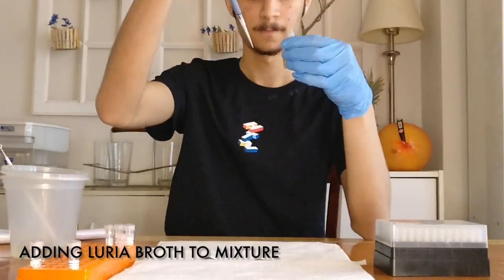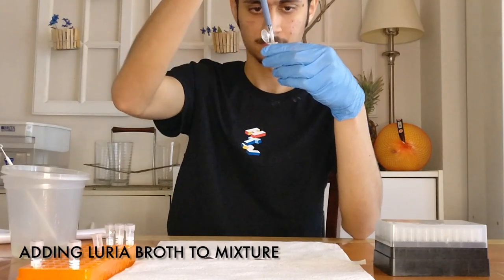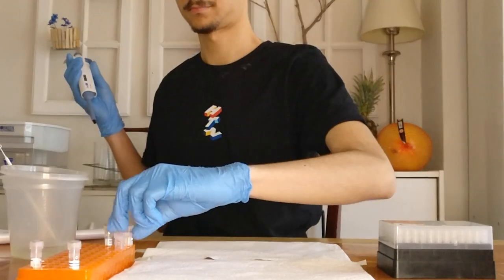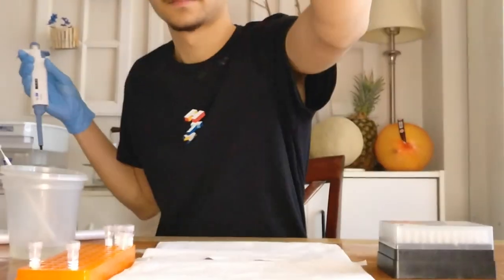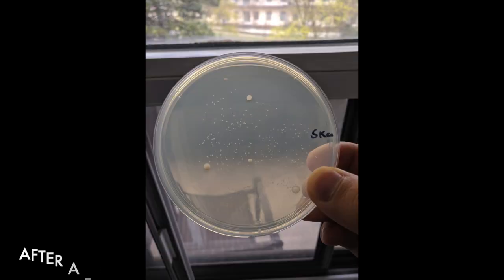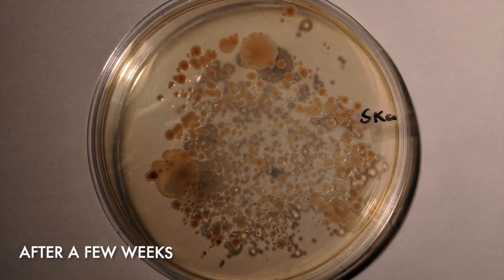Next, I added some Luria broth to the mixture, which gave the bacteria a source of nutrients to temporarily grow on. After letting the entire mixture sit for about an hour, I pipetted the solution onto a petri plate containing antibiotics. After a few days, this was how the plate looked like, and after a few weeks it became even more crowded. In the end, the experiment was a success — I had managed to make a gene edit in the bacteria and allow them to survive on a plate that would normally kill them.